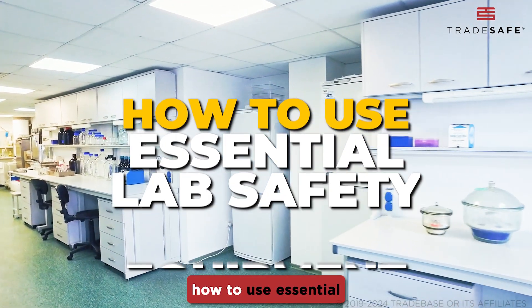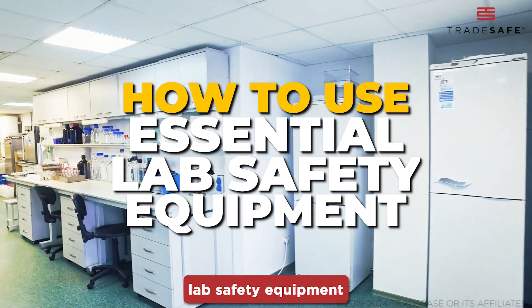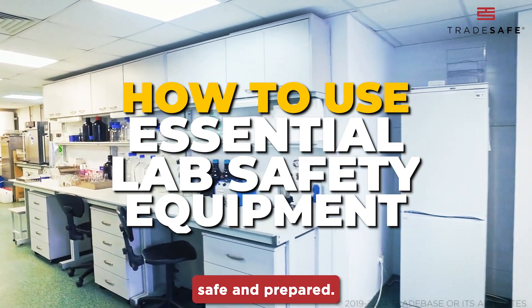Today, we're going to master how to use essential lab safety equipment to ensure you're always safe and prepared.